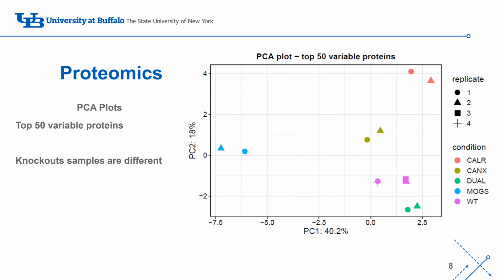We have started our experiment with the proteomics analysis. First we validated whether our samples are biologically reproducible or not using this PCA plot, and we can see that the biological replicates are close to each other. So it shows that our sample preparation is good and biologically reproducible.